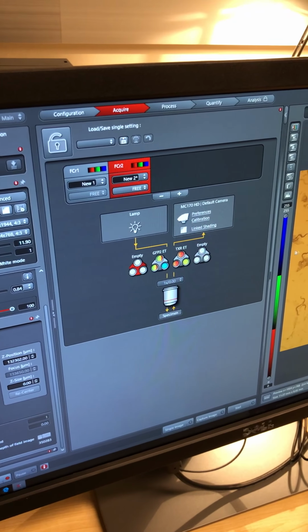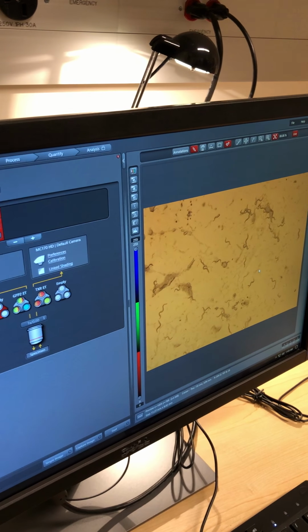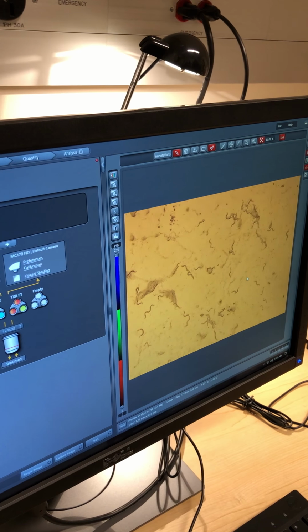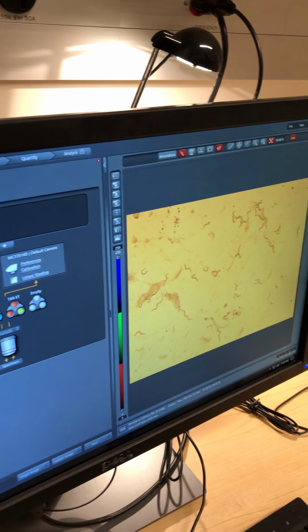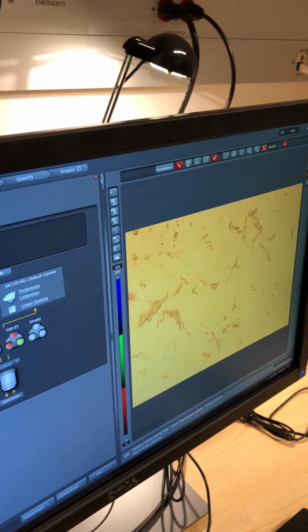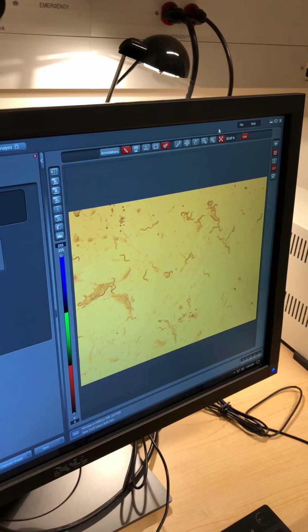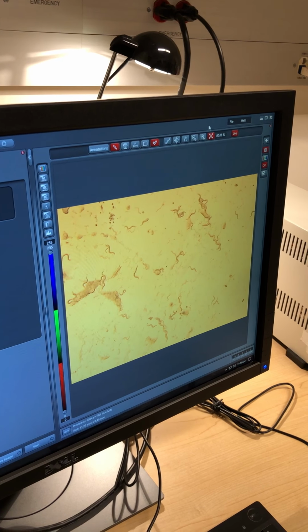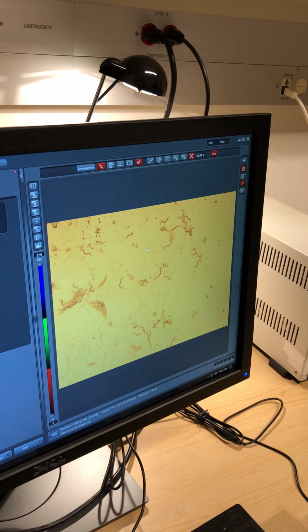Now, what looks bad right now? Do you think that's a good looking image? To me, it looks a little yellow. It's yellow because there is no filter there. This is a color camera, so what we're looking at is, in theory, real color.